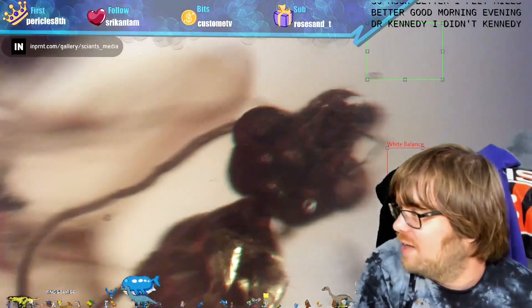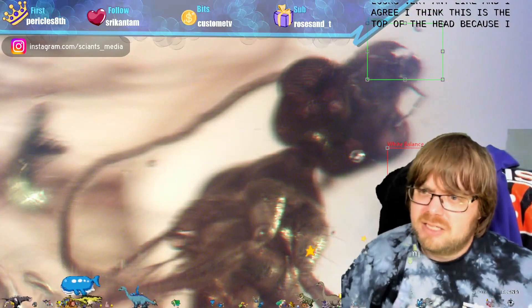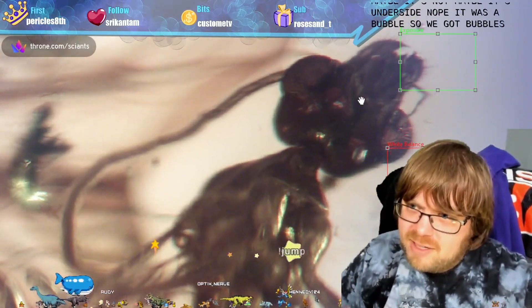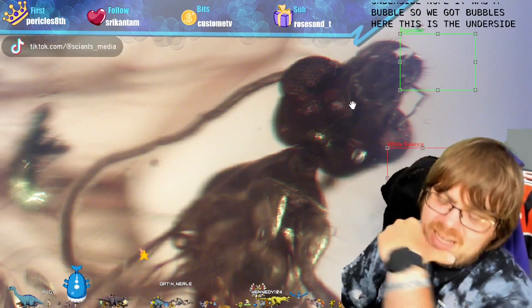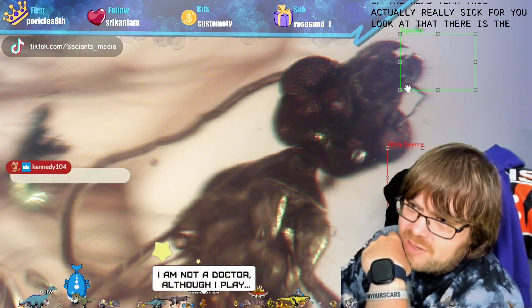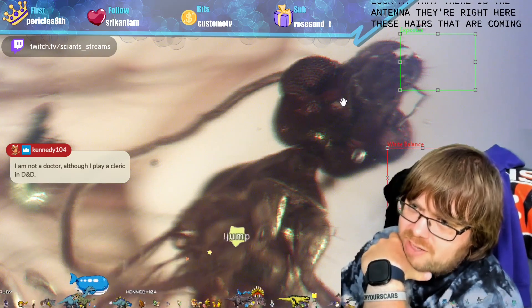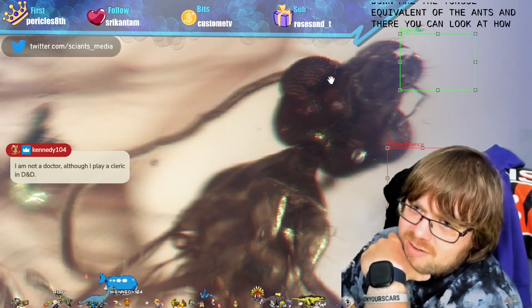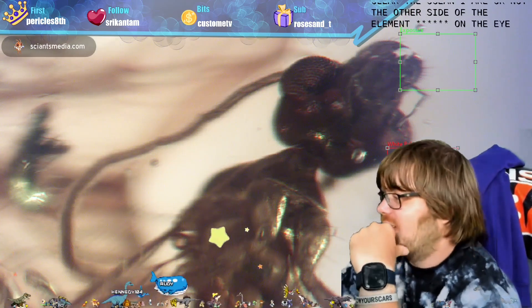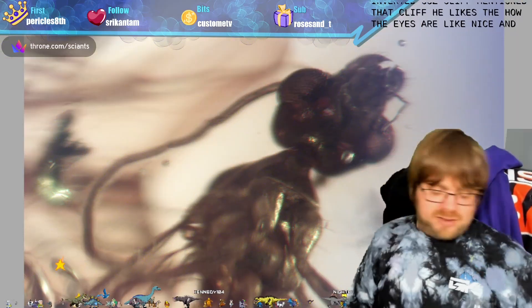This is the head - Cliff was suggesting it looks very ant-like and I agree. I think this is the top of the head because we can see the oceli - wait, maybe it's the underside. There was a bubble, so we've got bubbles here. This is the underside of the head - actually a really sick view. There are the antennae right here, these hairs coming down are the tongue equivalent of the ant, and look at how clear the ommatidia are in the eye.